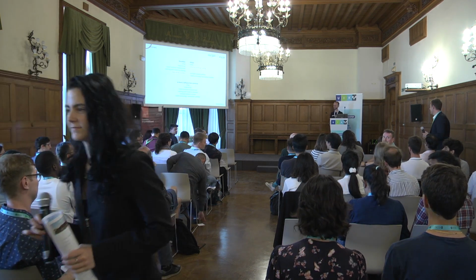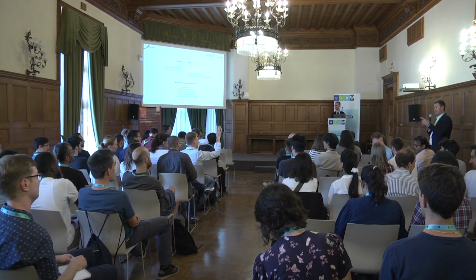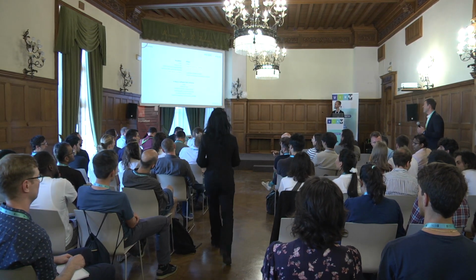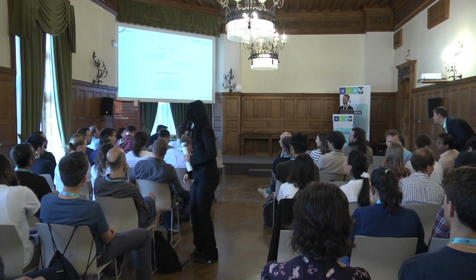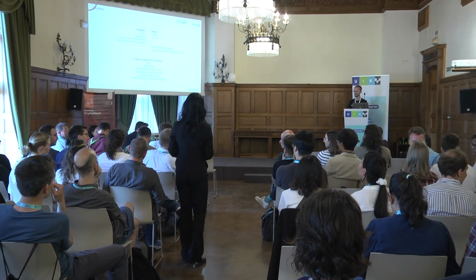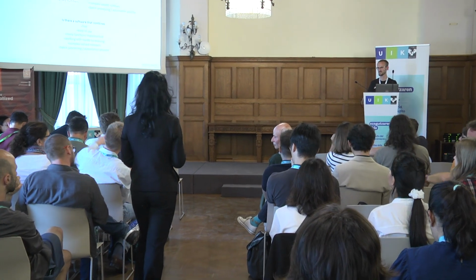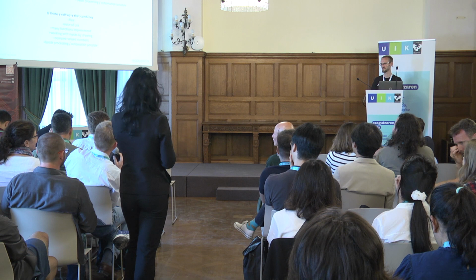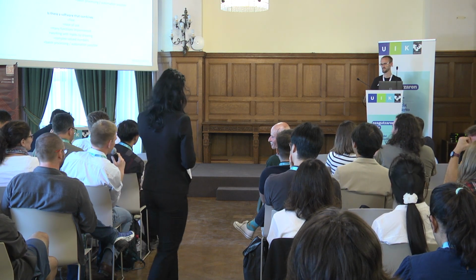It helps for sure. Okay, no more questions? Yes? And a suggestion to Neaspec, it would be nice if you develop a software. Actually, it's a missing part of your system. So just remove free there below. So make it not free and provide it with the system. So it's not free for everyone, but free for the Neaspec users. So this would be a nice solution.